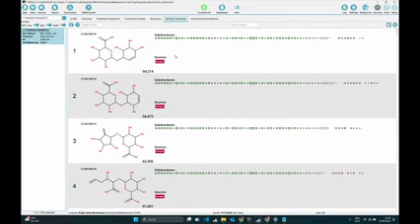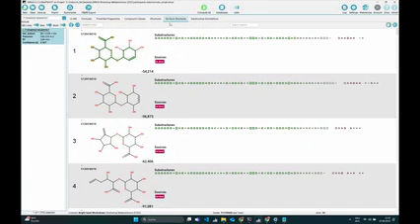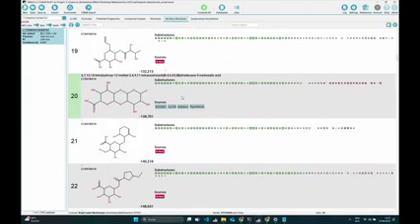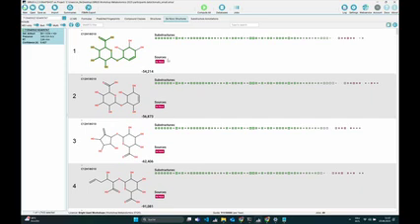And what you can see here, these seem to fit a little bit better. So just as a very quick first validation, you can right-click again, highlight matching substructures. Okay, most of this seems to fit. And if we stay in the de novo structures tab and just scroll down a little bit, we can see that our previous best hit is now at position 20. So we now got some new hits with MSNovelist which seem to fit our structure much better, and these hits are not contained in any database, in this example at least.